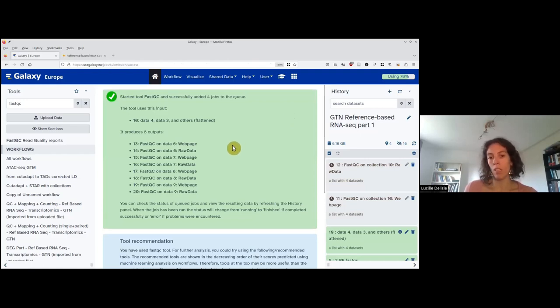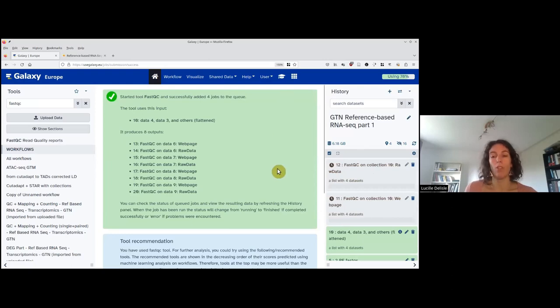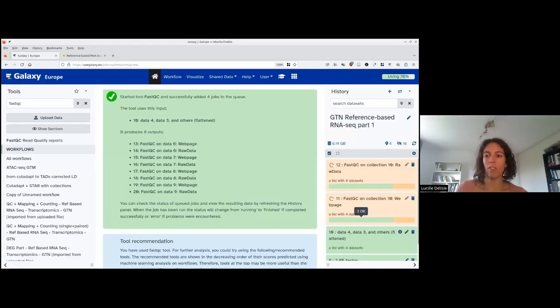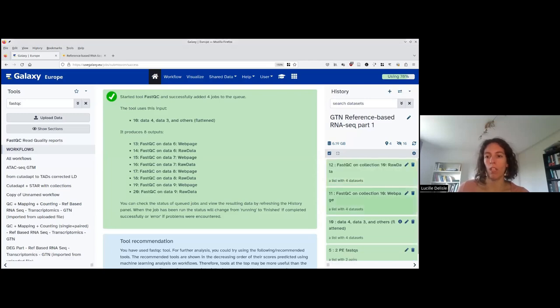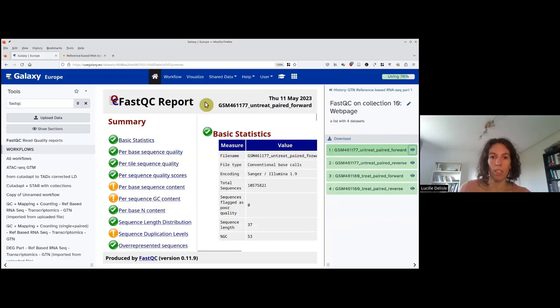The datasets are initially gray (waiting in queue), then yellow (running), and green when done. I'll pause and come back when they're green. Three are okay and one is running — so we can check the one that finished. I go to the web page for the 77 forward by clicking the eye icon. I can see the FastQC report. To see it larger, collapse the panel on the left by clicking the arrow on the bottom left.